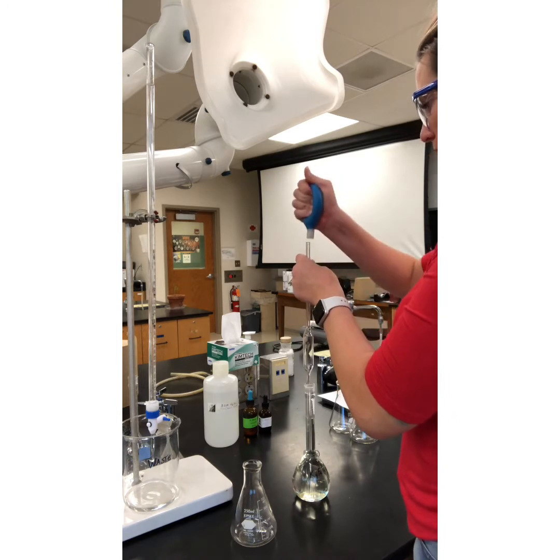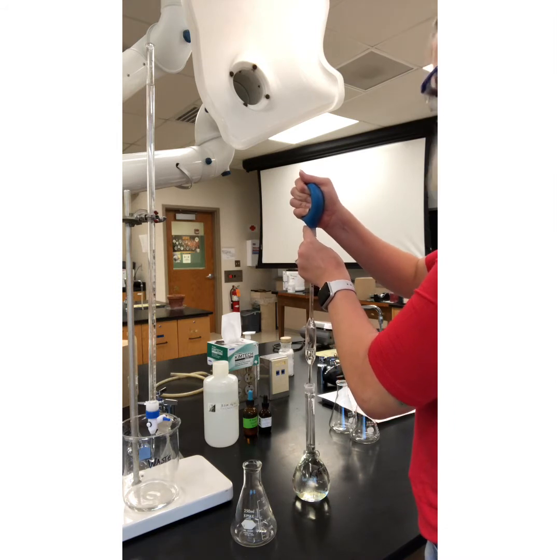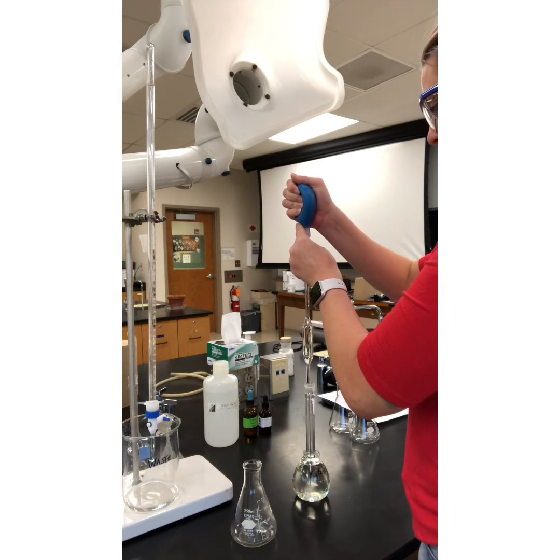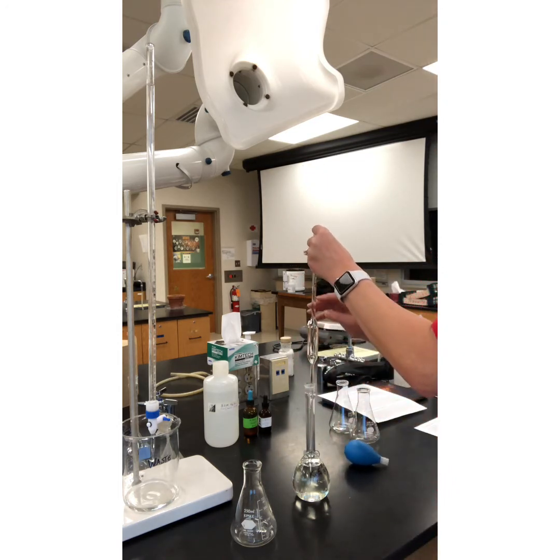All right, so squeeze out my bulb. Go ahead and pull my solution up in. That's going to be another squeeze. All right, it's getting close. It's going to go fast when it hits that spot. All right. So there we go. I've gone past. My mark is right here. My solution's right here.